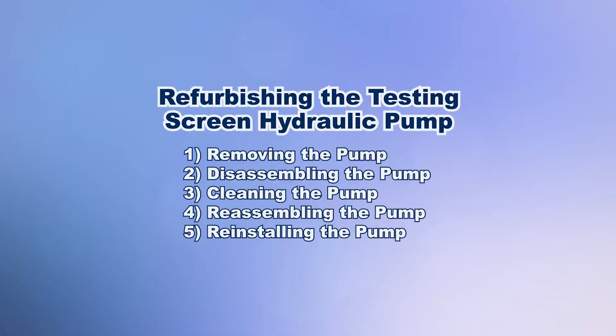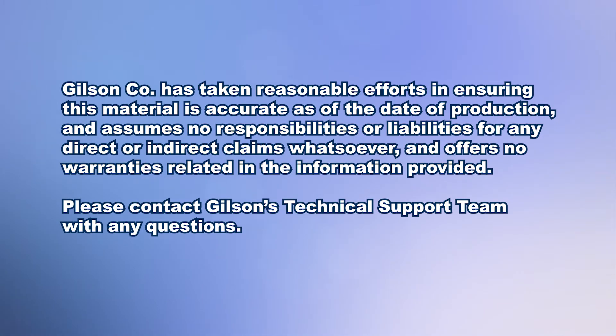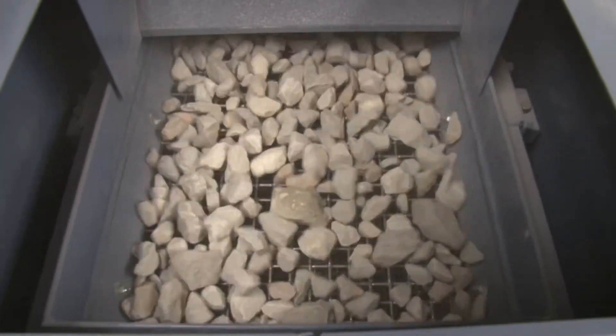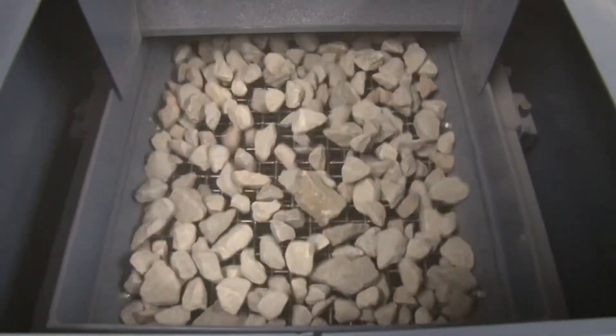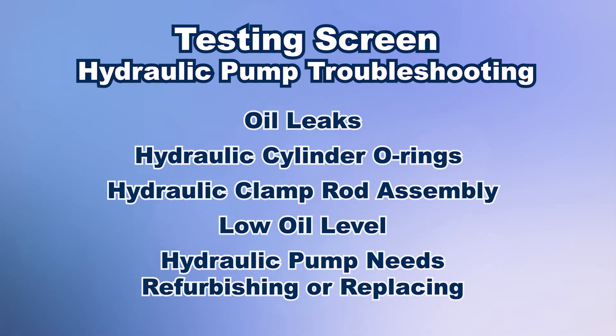The Gilson testing screens are rugged, tough machines that use a quick-acting hydraulic pump system to clamp and release the screen trays within the unit. If you find your screen trays become loose within the separator during testing, or you can't clamp them tight enough for testing, leaks or faulty seals in the hydraulic clamping system may be causing the problem. Contact Gilson technical support for help in diagnosing these issues and what steps should be taken to resolve them.